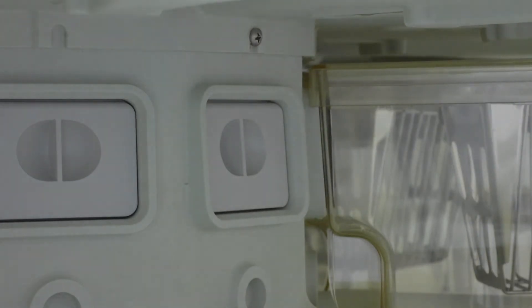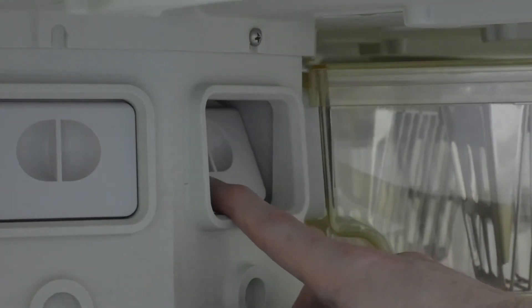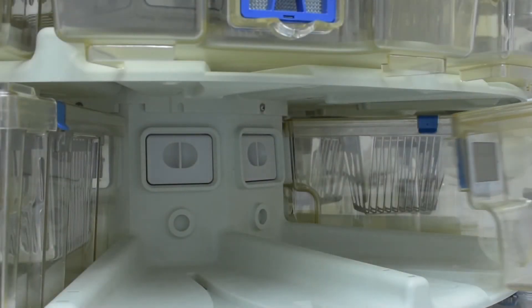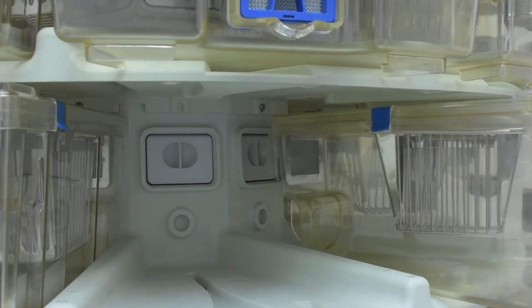When the cage is docked, a back flapper door opens and exhaust air from the cage travels through this into the rack's central plenum, and then directly out of the room and out of the building.